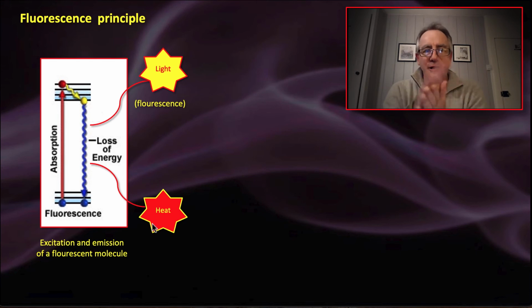All matter does that. If I rub my hands to get them warm, what I'm doing is putting energy into the atoms, and it's generating the heat of friction that you feel in your hands. Heat is emitted. There are some molecules that have a very special property, and that is that they are fluorescent. When they fall back to ground state, they do emit some heat, but they also emit photons, which are light. Molecules that come in that category are called fluorochromes. So you put some energy in, usually in the form of light, and when they fall back to ground state, you get light back out.